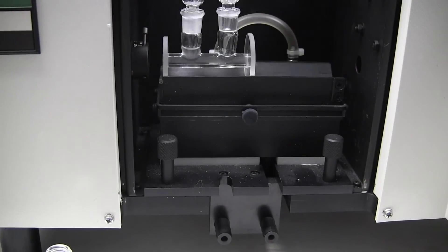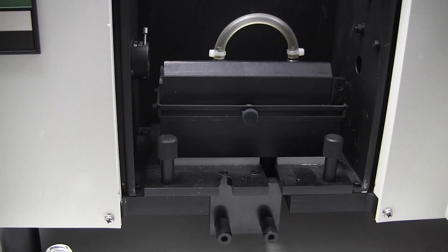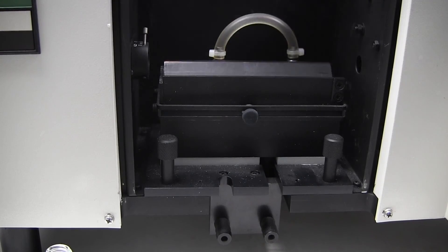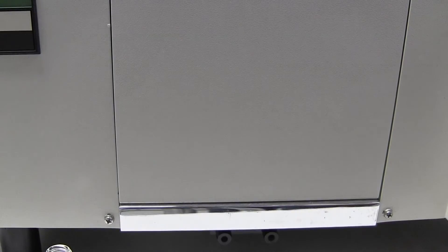Wait until the instrument returns to a constant of zero and then analyze your solution two more times. You will need these three numbers to determine the specific rotation of your compound.